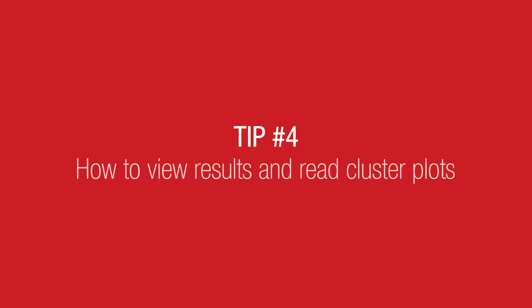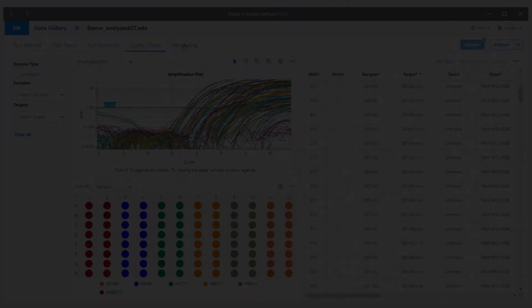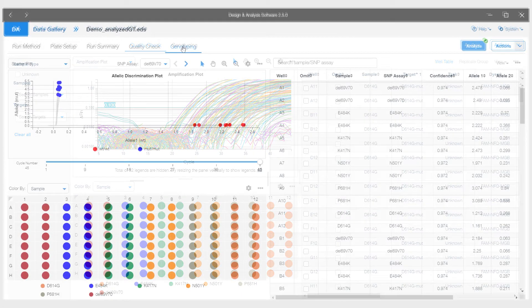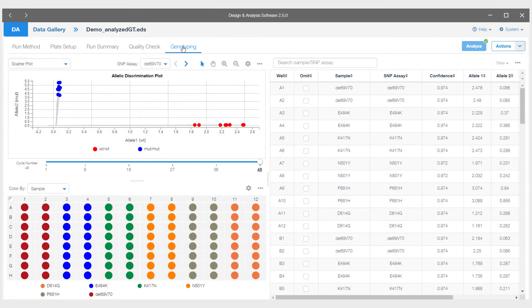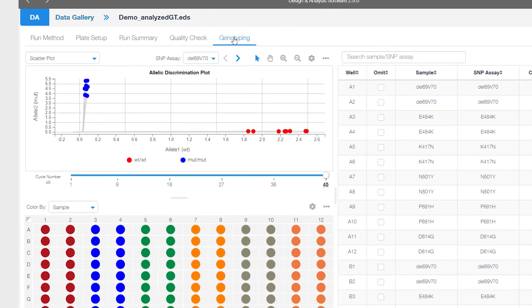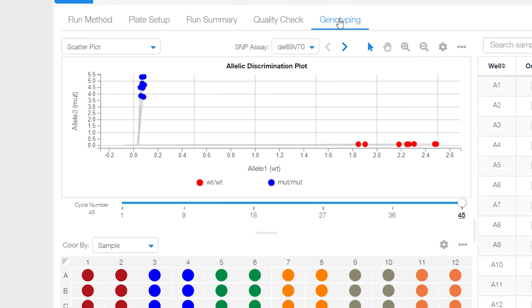Tip number four, how to view results and read cluster plots. Click on Genotyping along the top menu. Here you will see a cluster plot, which is how to view results from the TaqMan SARS-CoV-2 mutation panel.